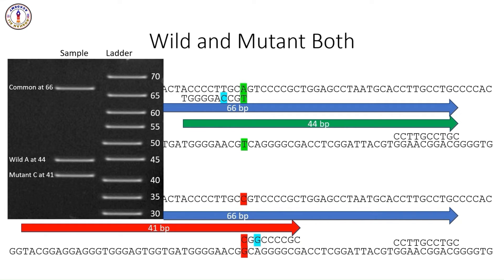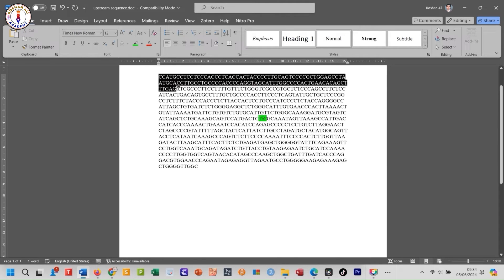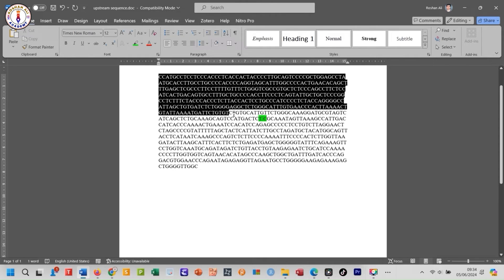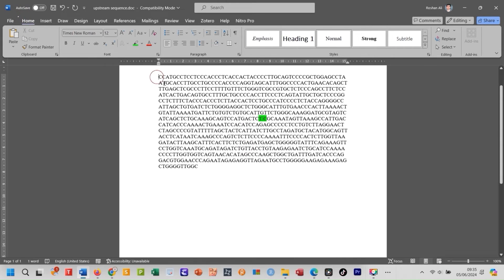How to use Primer1? First, you must have your DNA or RNA sequence which contains your desired SNP. This is our example sequence, and here is the SNP position. You must have approximately 100 to 500 bases before the SNP and the same amount after the SNP position. Suppose you have T in one allele and C in another allele. Now determine the position of the SNP in the sequence — you can find this using MS Word very easily. Just select from the start till the SNP position and check the character count. You can see it is at position number 401.